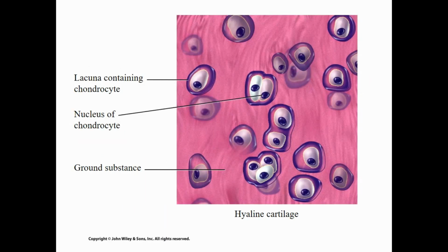And here is the artistic version. And I'm sorry, but if that doesn't look like a pair of googly eyes, then I can't work with you. You just don't have a good sense of vision there to be able to tell me that those are googly eyes. I don't care what anybody says.